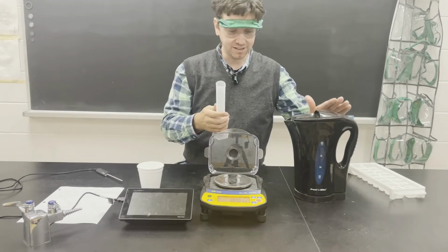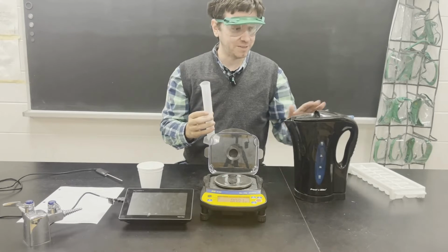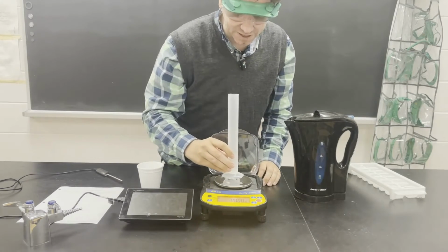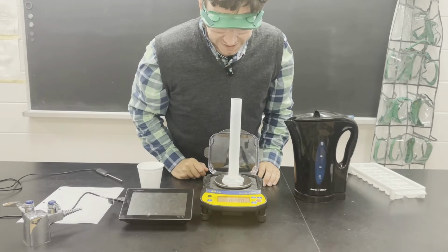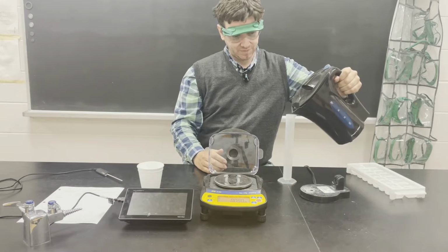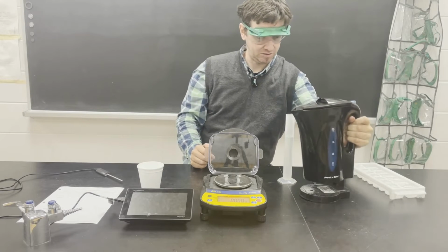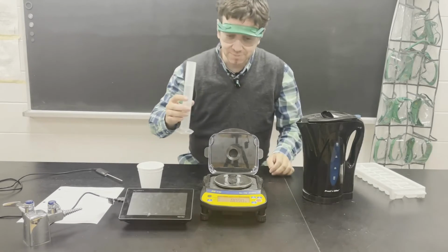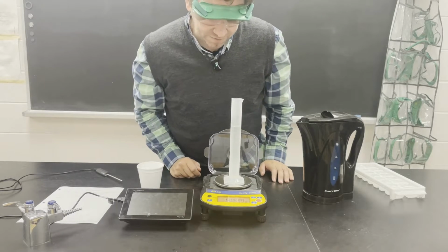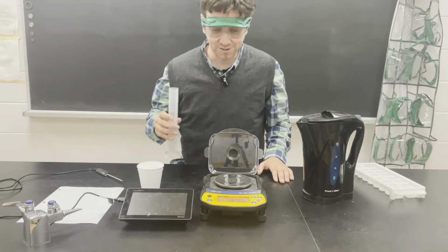Next, I have boiled water here, and I'm going to put about 90 milliliters into our graduated cylinder, but we're going to determine the mass of the water using the scale, not the density. The scale's a lot more accurate than this graduated cylinder. So let's figure out the mass of the graduated cylinder. It's 46.380 grams, and then I'll put in about 90 milliliters. It's a little bit less, but that's okay. Together, their mass is 130.592 grams. So you can subtract those two to figure out the mass of the water.